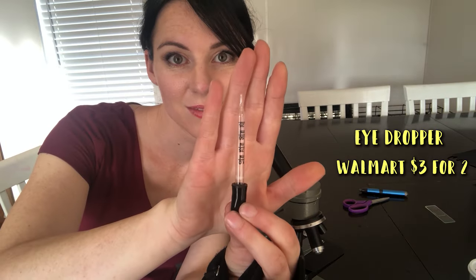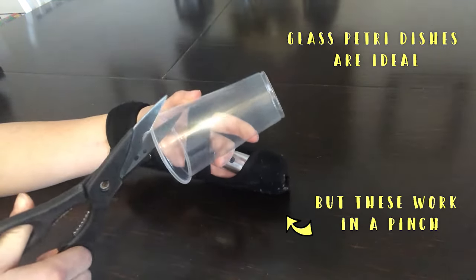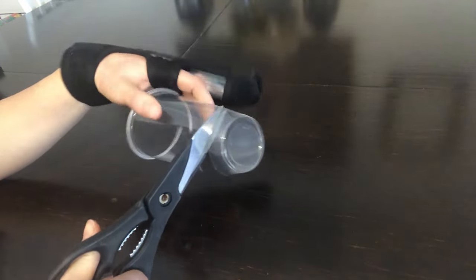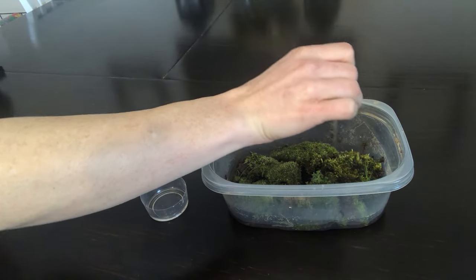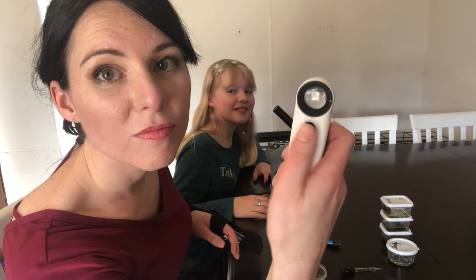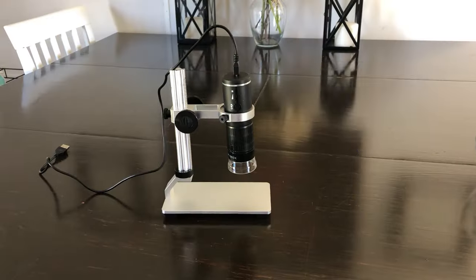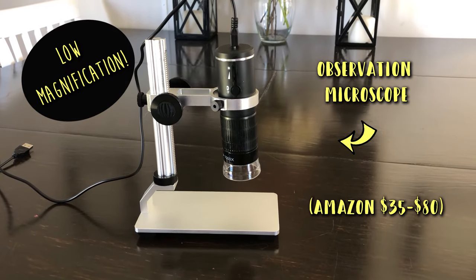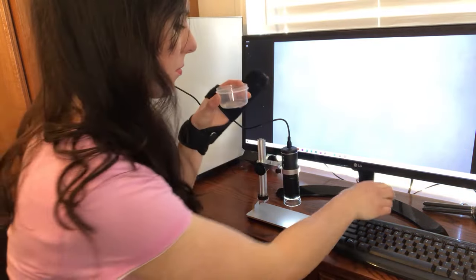I grabbed some eyedroppers from Walmart and made some observation dishes. Glass petri dishes are the best choice because of the way water clings to plastic, but some cut-up plastic cups can suffice in a pinch. Suck up some water from your already soaked moss. Early on in our hunt we tried a lighted magnifying glass, but it didn't work because tardigrades are just too small. I was so excited to get an observation microscope because its low magnification would allow me to see things that are too small for the naked eye, but not at such a high magnification that viewing a bunch of moss water samples would take a million years.